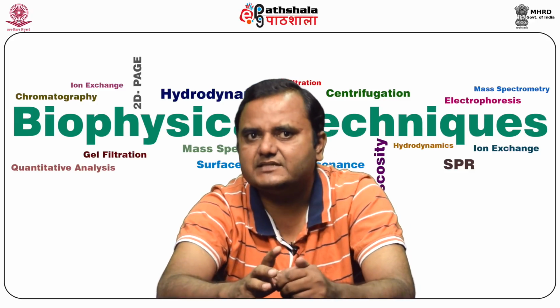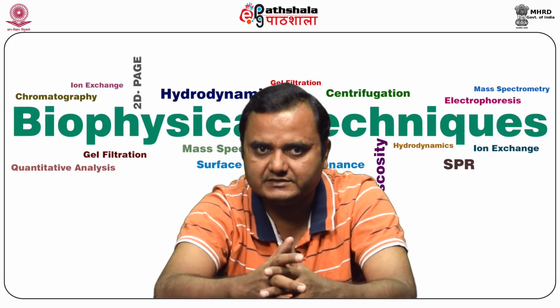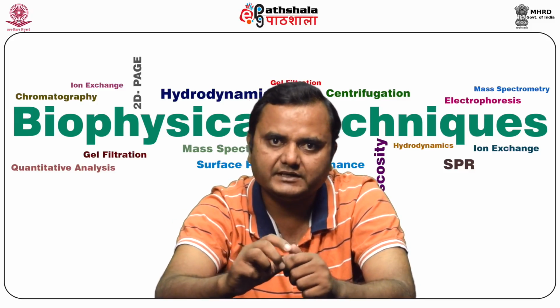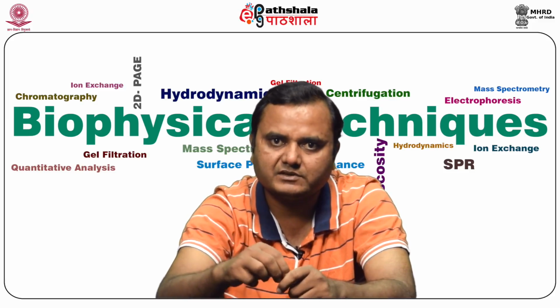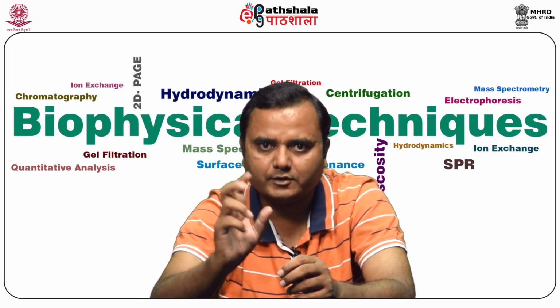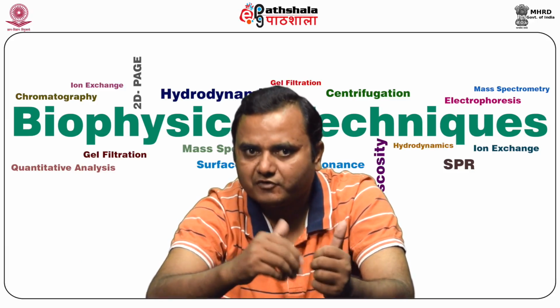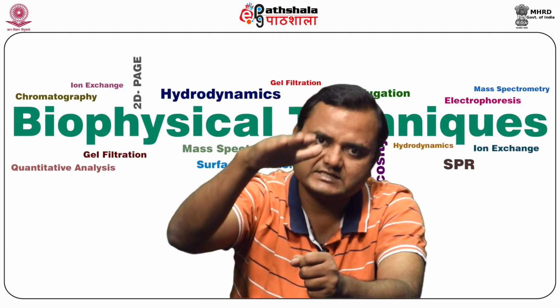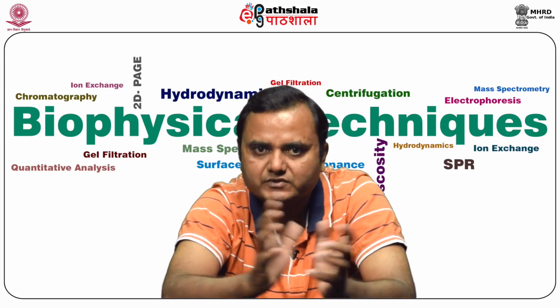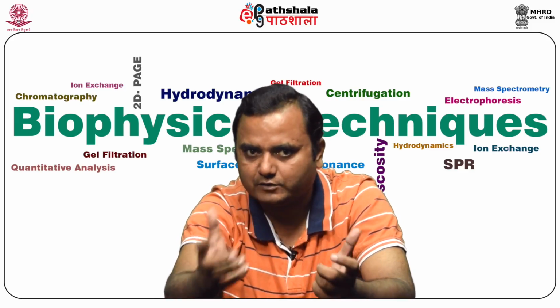Another gradient medium is the cesium chloride density gradient medium, which is used for isopycnic or buoyant density centrifugation. A linear gradient of this compound in a buffer is prepared in the centrifuge tube. As the concentration of the compound increases, the density of the medium increases in the tube. Density is low at the top and high at the bottom, and macromolecules will form a band once they reach the buoyant density corresponding to their density. They stop at a particular position, which is useful for separating molecules of different densities even when the densities are very close.